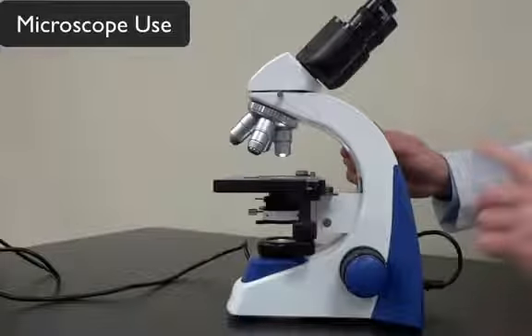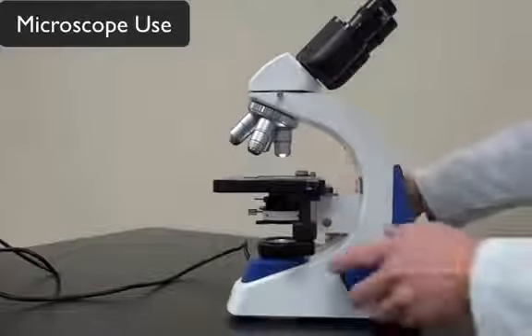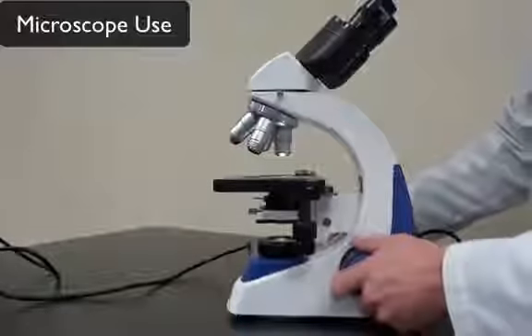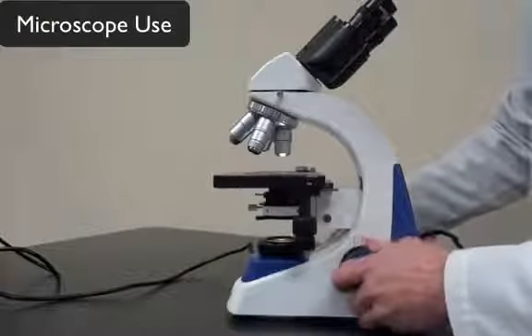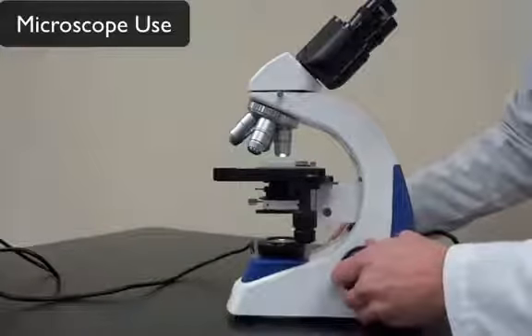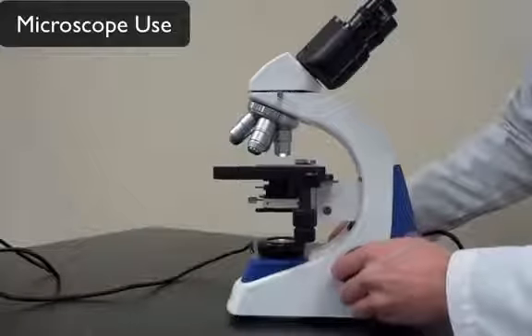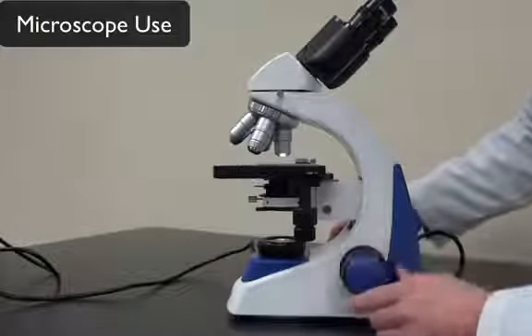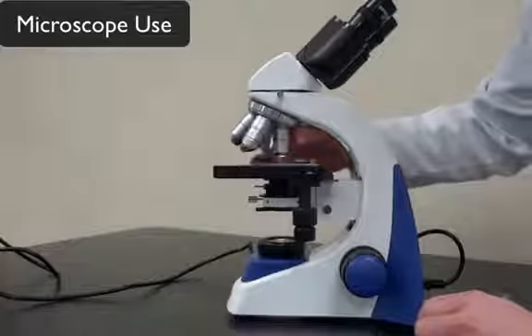Now, first step is to make sure you have it in scanning power again, and what we're going to do is raise the slide all the way up with the coarse adjustment. Okay, so it can't go any higher than this. Alright, so once we have it there, we know that we're okay as long as it's in the scanning power.